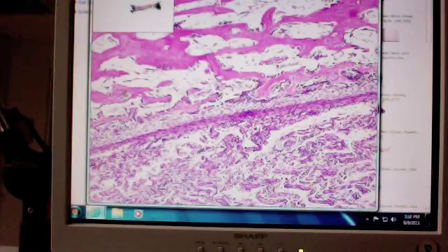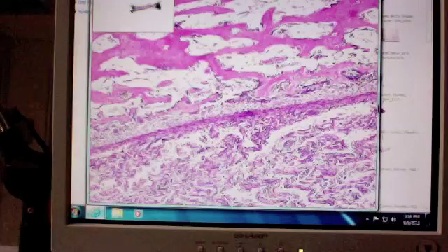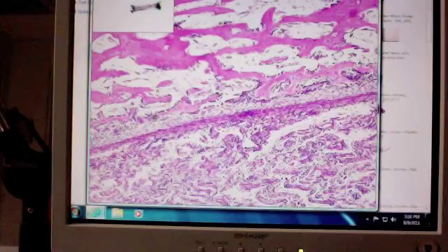Yes? Do chondroblasts lay down lamellar bone? No. I mean osteoblasts. Osteoblasts lay down all the bone, all the types of bone. When they're working in rows, like we can see down here, you see these whole rows of osteoblasts. This is when they're making lamellar bone.